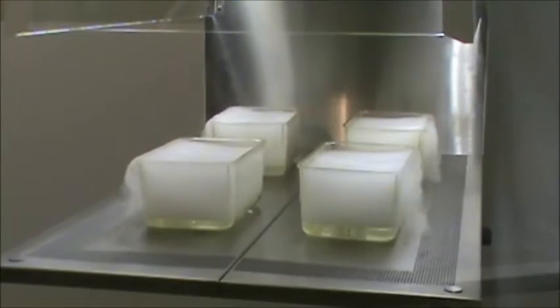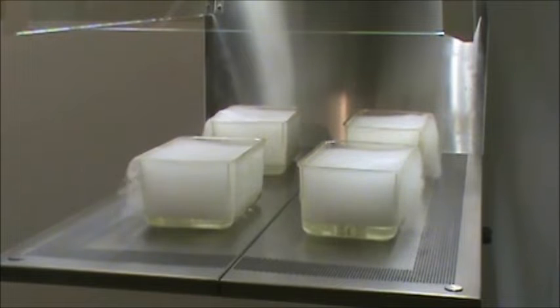You can see that as the vapor escapes the cages, it is pulled directly into the vents around the perimeter of the unit. The unit's partially recirculated vertical flow and unique momentum air curtain design greatly enhances its ability to protect both the user from allergens and animals from contamination.